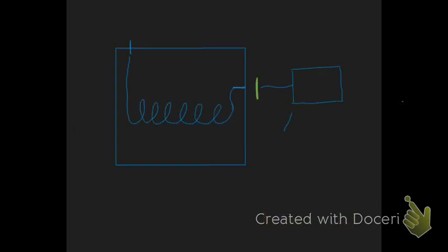So here's just kind of a little diagram of what the instrument looks like. You have basically a big box, which is the instrument itself, and the sample gets injected at the very top, at which point the material will move in, being directed by the flow of the helium. It goes down and goes around all of the loops of that column. And eventually, hopefully after they've been separated, it comes out over here, and those compounds will hit the detector.